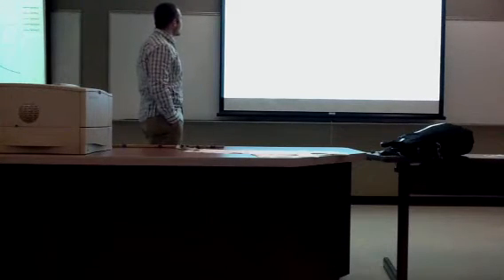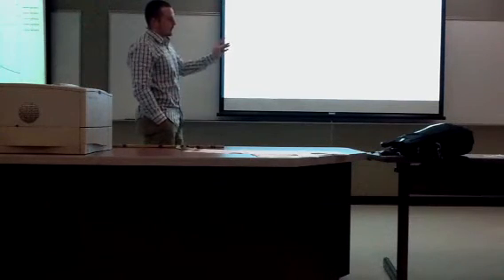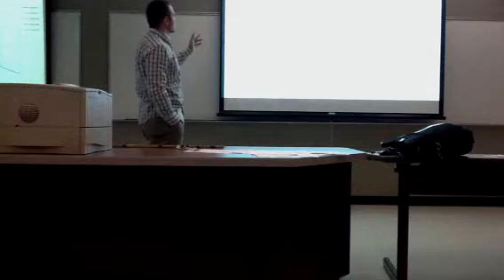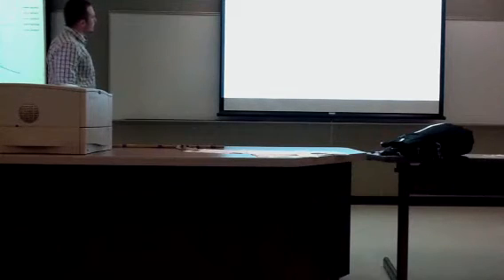So on this slope you would have to do a correcting factor for the heat loss, but I get the line of it right there, and that gives me the temperature increase per time on each of these reactions.